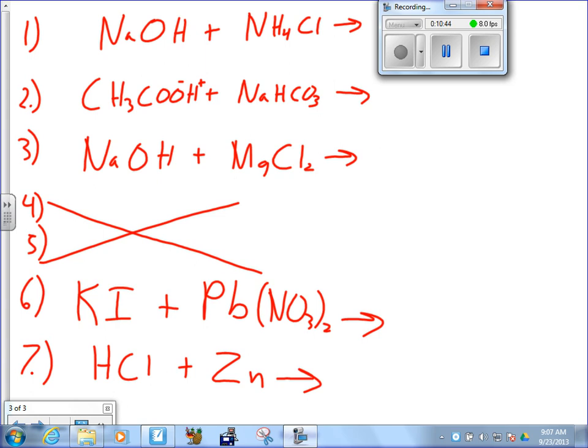So yeah, be aware. Those are the signs of a chemical reaction. Those are the things we're going to need to watch for. Guys, you don't need to watch any of these reactions for very long. The reaction is immediate in all of them. I made sure. That's why everything's so concentrated. Then it takes less time.